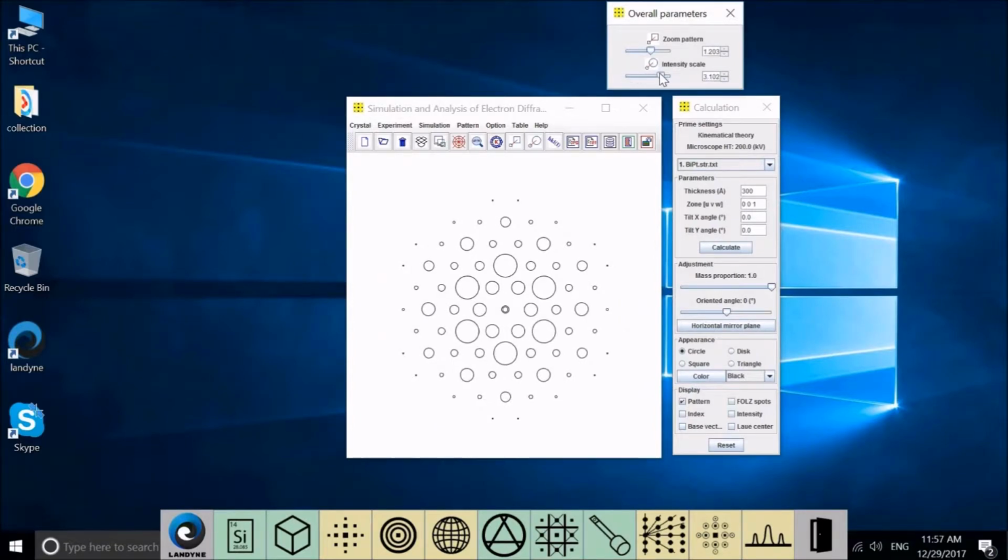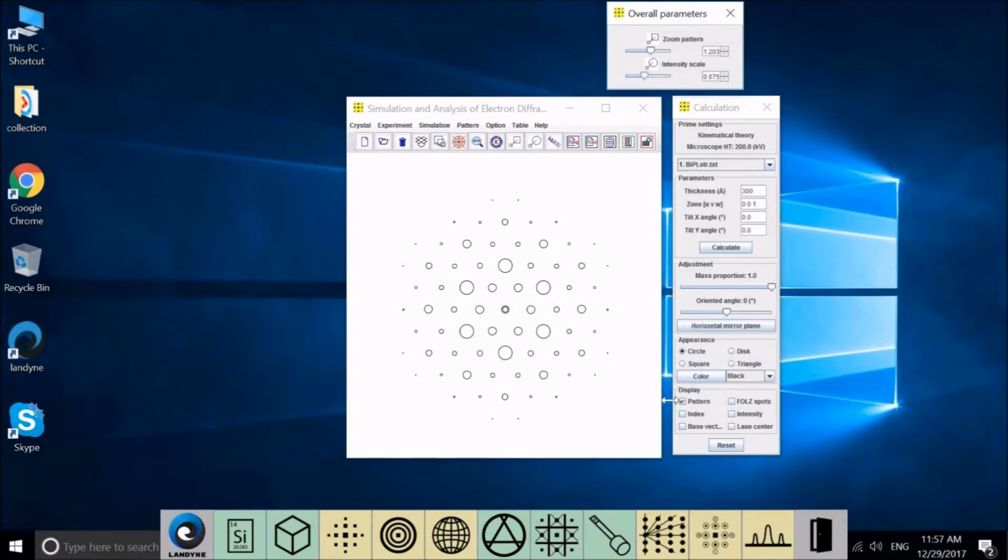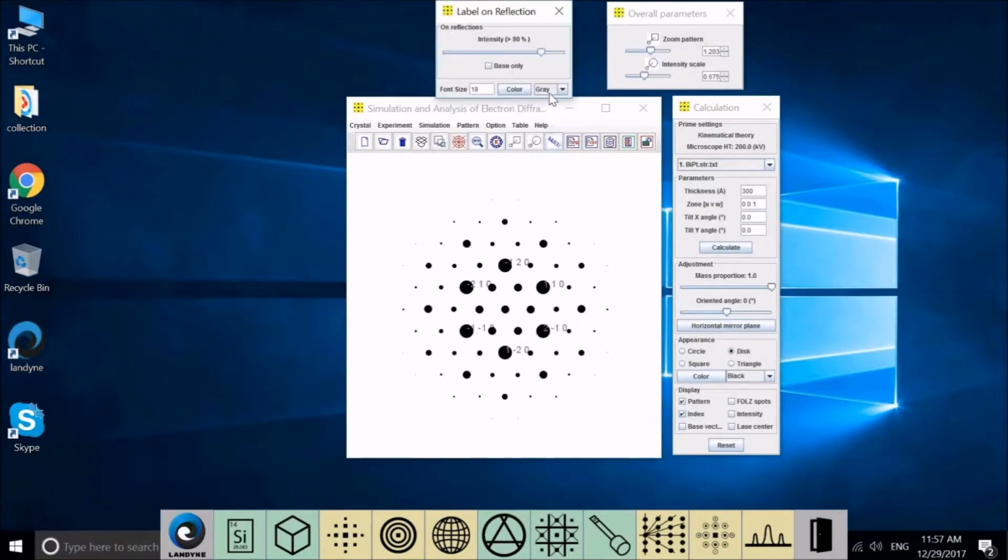Put index here. Reduce index to that. Put number to 20. This is the hexagonal phase, but the index we gave is a 3-number index.